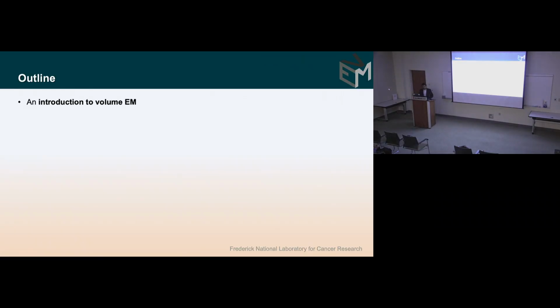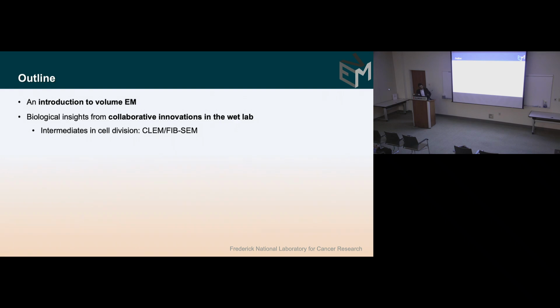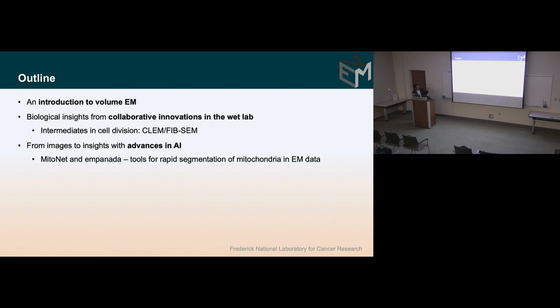Okay, so I'll introduce volume EM. I'll give you a couple of examples from the wet lab side of things, primarily with FIB-SEM. I've taken out some of the other approaches for simplicity, and then finally I'll talk about images to insights with advances in AI.